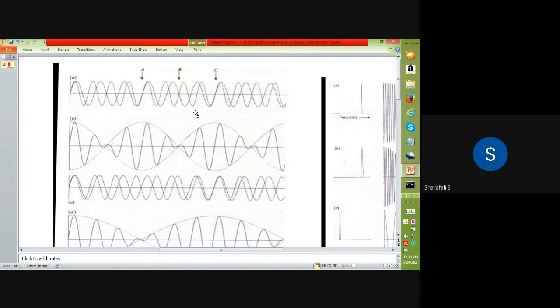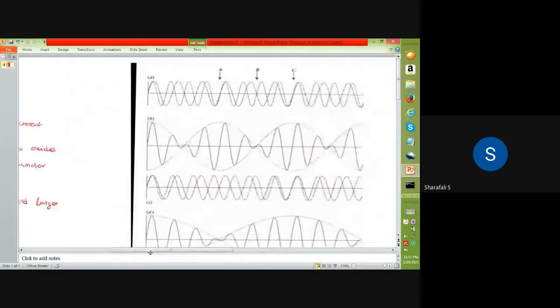So in all those cases, we have to sweep all frequencies by rotating through all the frequencies by rotating the prism or the grating. Getting each spectra, I will explain.